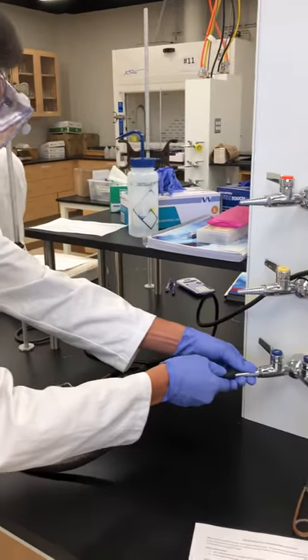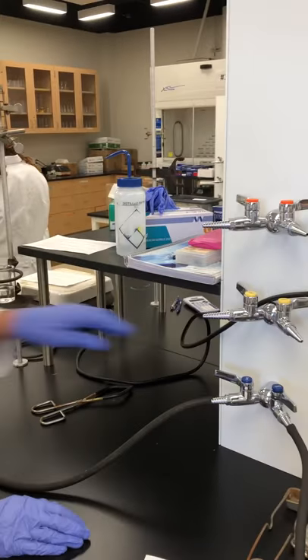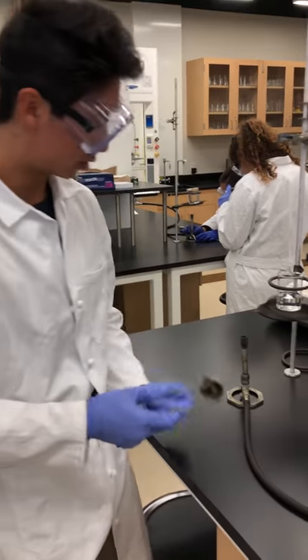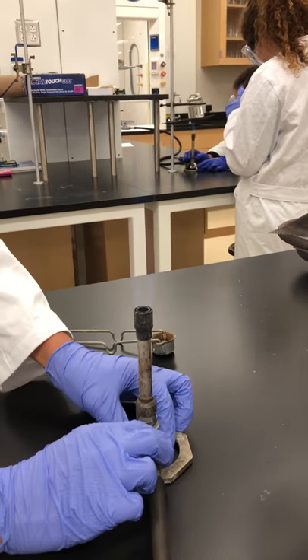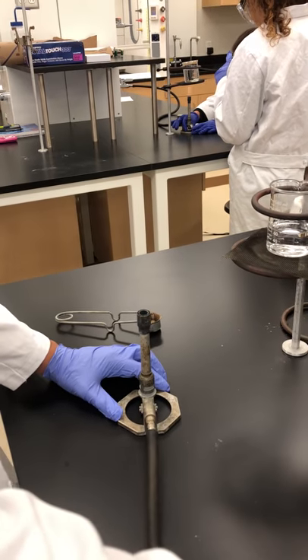Bring it up to the gas valve right here. I'm going to turn it open slightly. Using the striker, you can see it lights. I'm going to strike it once. I'm going to adjust the flame slightly so it is not too high up.